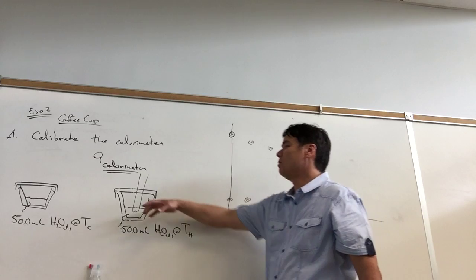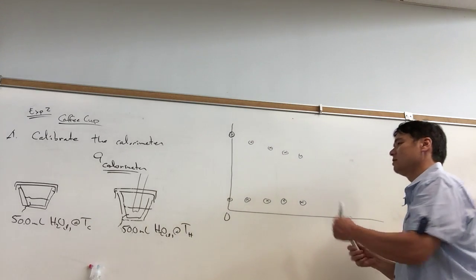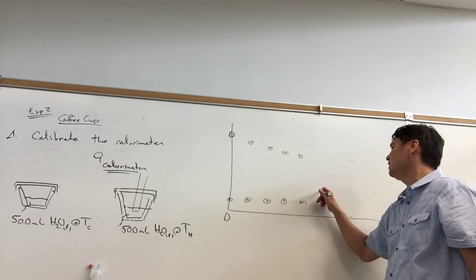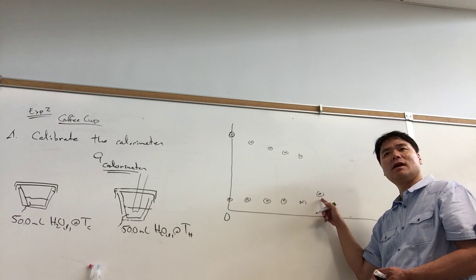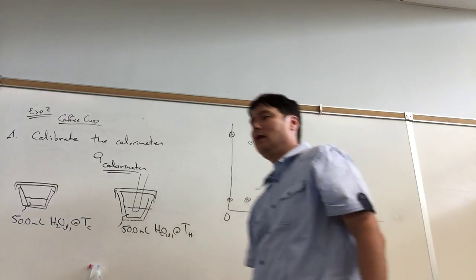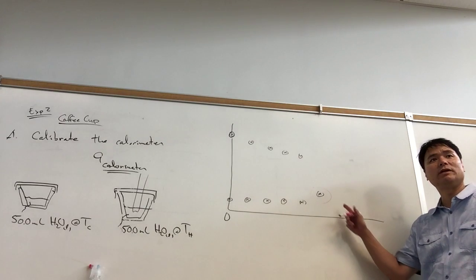And so at minute 6 we mix it, but the problem is it takes time to mix, doesn't it? And so at minute 6, you know, this thermocouple is now sitting in air. And so this reading here is not the reading of the water, but the reading of the air temperature. And so this reading is invalid. And so we discard this point here.